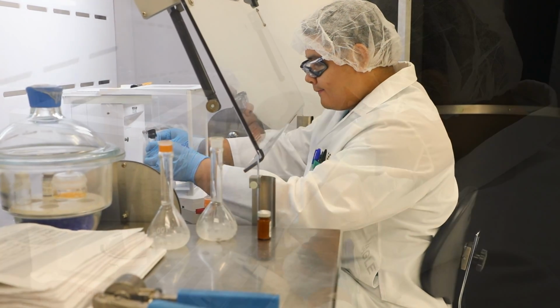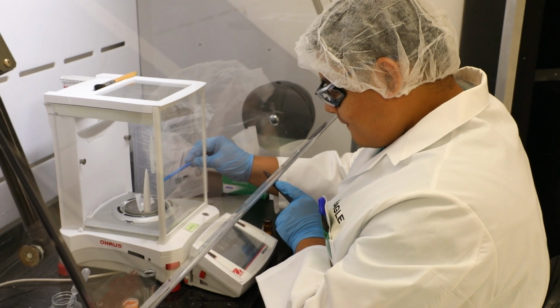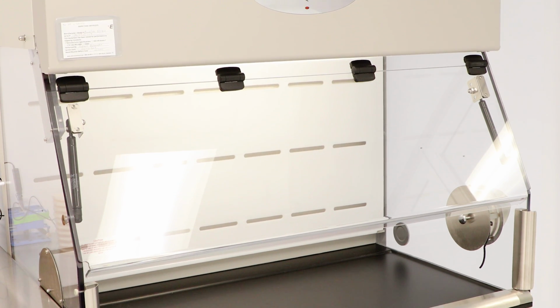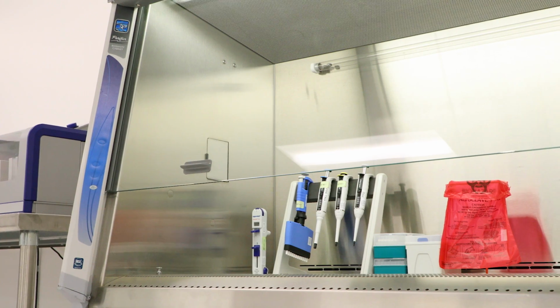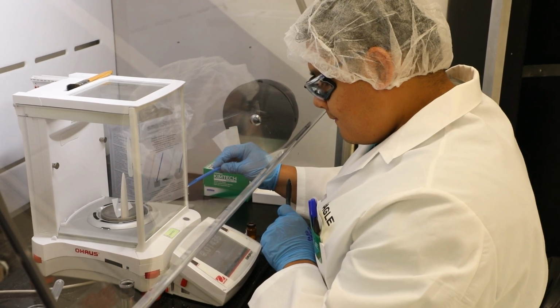Pre-sterilization procedures, such as weighing and mixing, must be done using a method of containment, such as single-use glove bags, containment ventilated enclosures, otherwise known as powder hoods, biological safety cabinets, BSCs, or compounding aseptic containment isolators, CACIs.